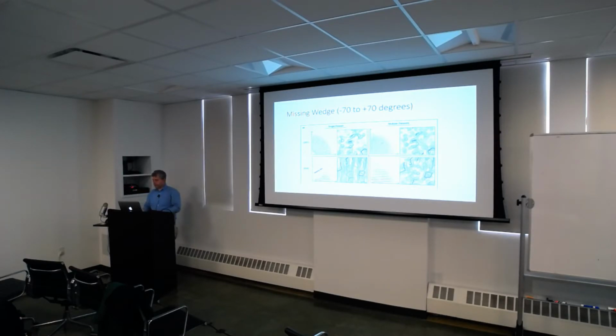But that could be a little bit hard, and practically what you do is collect multiple data sets on multiple crystals. Generally on one grid you're going to have a lot of crystals. If you only have one crystal, it's going to be impossible to find anyway. Hopefully the crystals are lying in different orientations on the grid. If they're not, then you might have to take care of symmetry arguments, or you might be stuck where you do have some missing data, and that will blur out your resolution in one direction, similar to what happens in tomography.